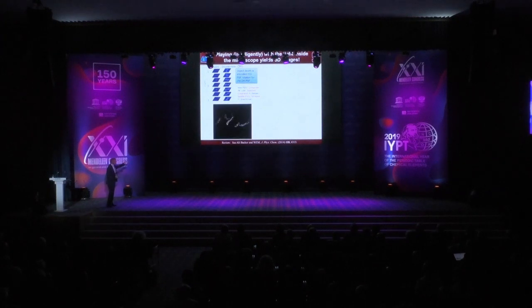So you can use that to get 3-dimensional images like these, where the surface of bacteria are colored one color, and there's a protein inside that's colored with a different color. And this is really just playing with the light from the molecule. Since we understand how that light works, how it behaves as it propagates through space and so on, you can make these sorts of changes, and you can even make a single emitter look like a happy face, believe it or not. So here's one thing my students did.